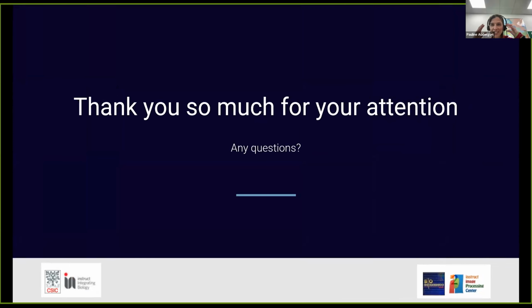Thanks a lot, David. Great talk. We have a question from Dimitri that first says that it's a very nice presentation, but he would also like to know if he understood properly. His question is, do I understand correctly that I need only the particles for flexibility analysis, no original micrographs?